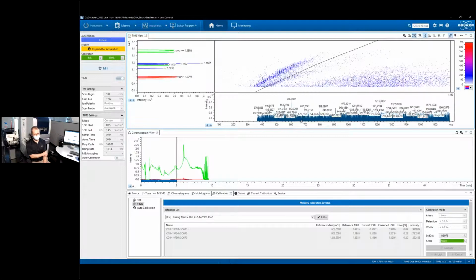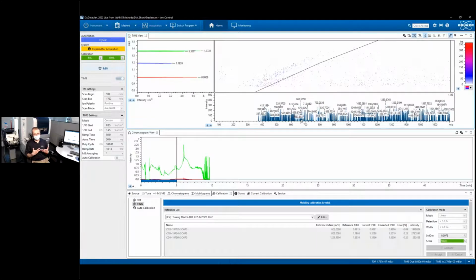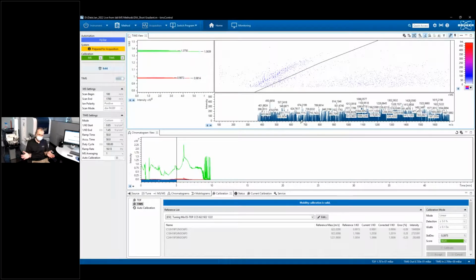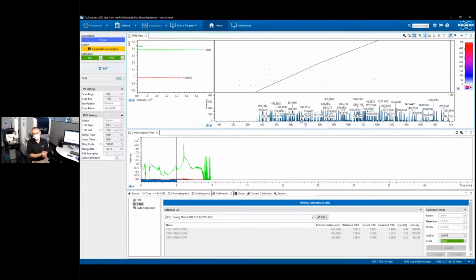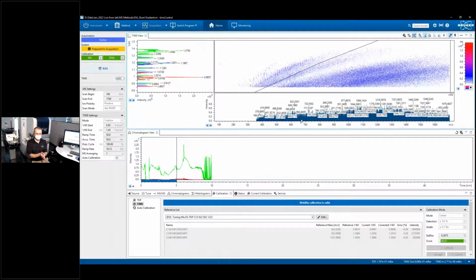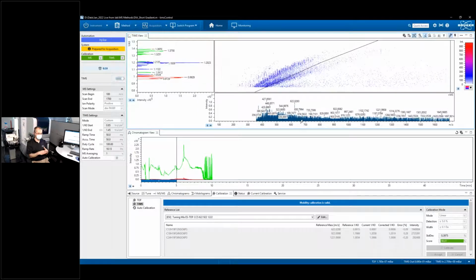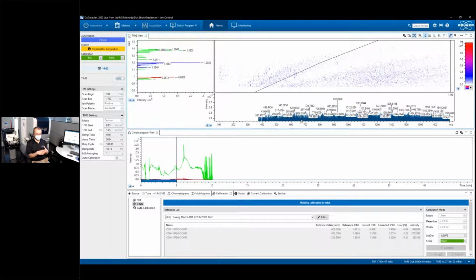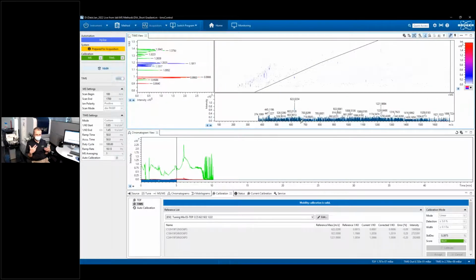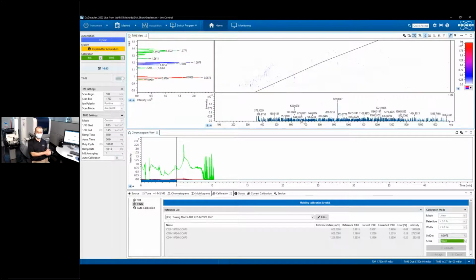That's what we're searching against. Obviously, if you want to go into even more depth, then the workflow would be to fractionate your sample, typically a pooled sample of your sample cohorts, into anything from 8 to 24 fractions, acquire DDA in those, and use that as your library. But as you mentioned, the alternative workflow, which is now becoming quite established, is this library-free approach, where we're not having to supply a library, and it's effectively doing in silico library production.